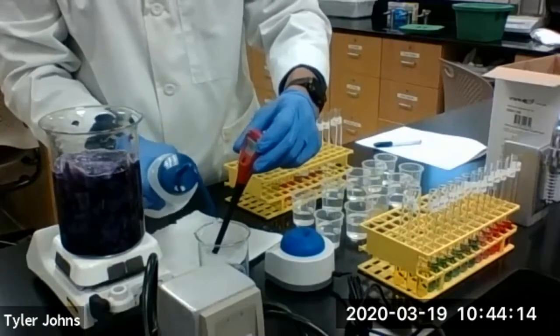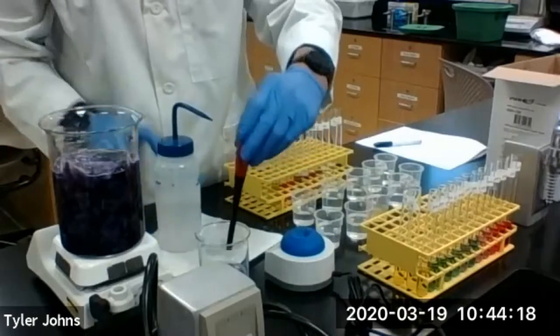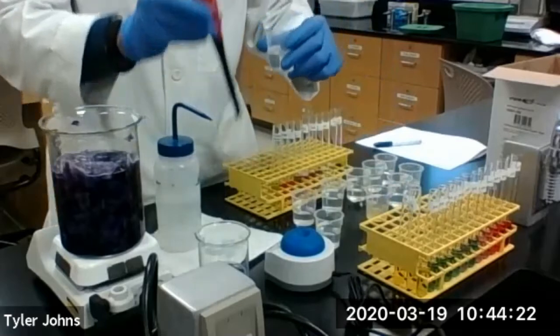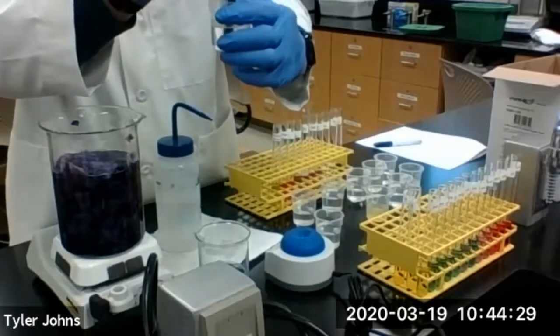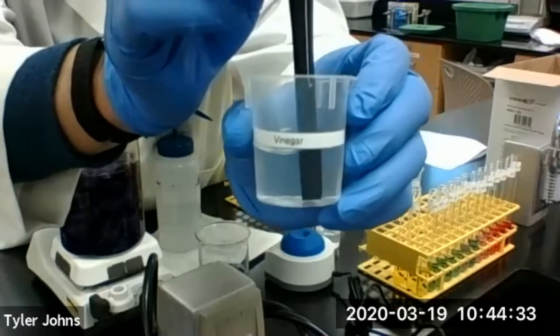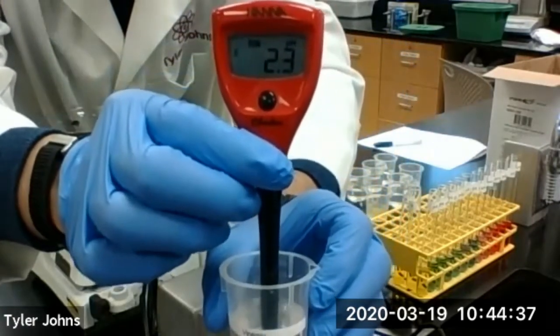Rinse our pH probe, and we'll measure our vinegar. So we have our vinegar, and our pH.